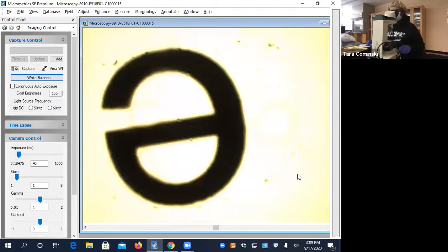Okay, now you're gonna change. So now it's in focus. Whenever you're focusing something on the microscope, like any slide, and I have another slide I'll show you guys, you always want to start under scanning like we did, okay? Get it in focus. Now you want to get it under higher magnification. So now you're going to switch your objective. Don't touch anything else. Just switch your objective to the low power one. Usually it's the yellow one. Yep, okay? And now I ask you what the magnification of that objective is. What is it? Do you know?